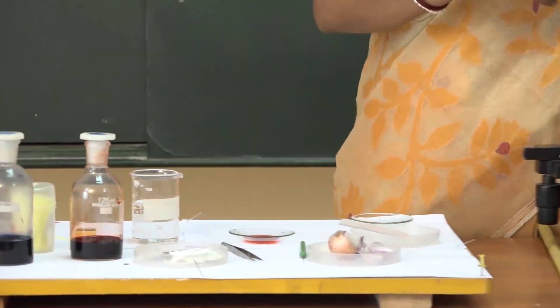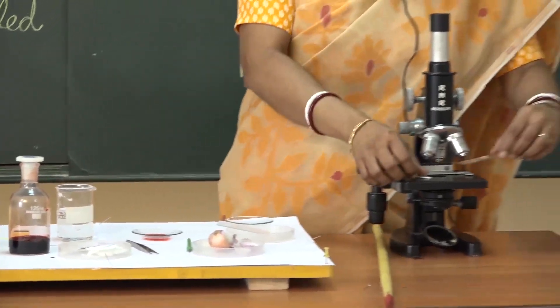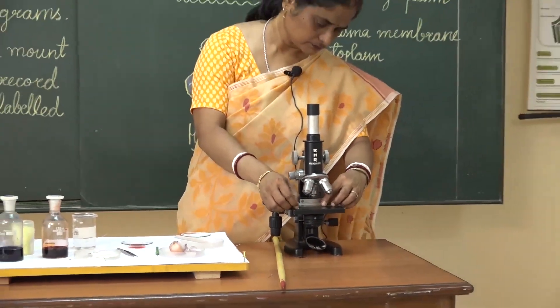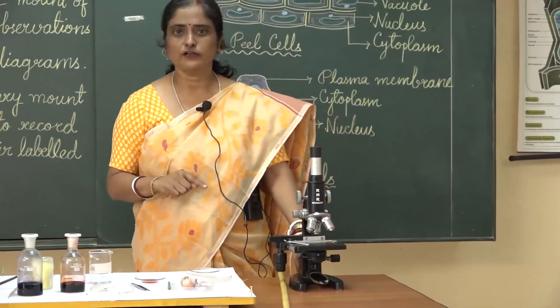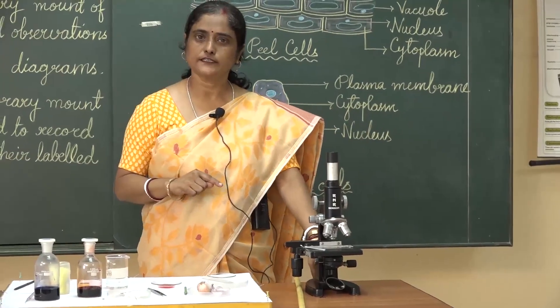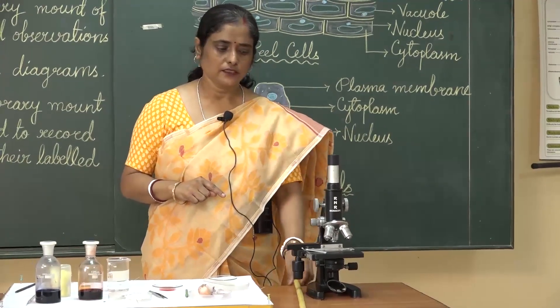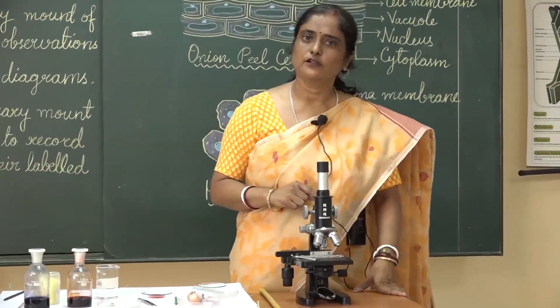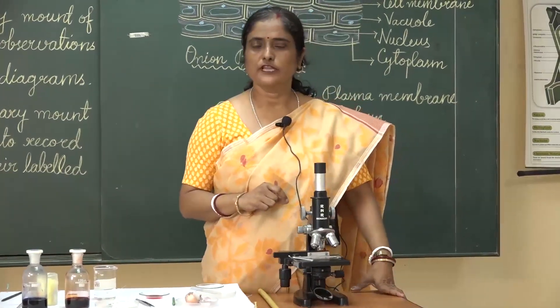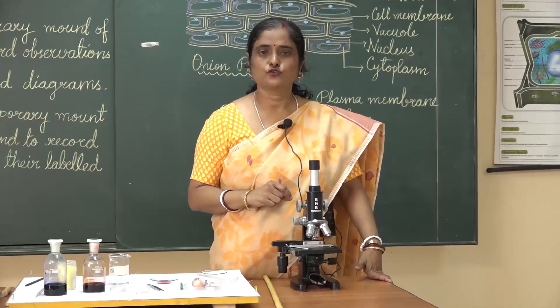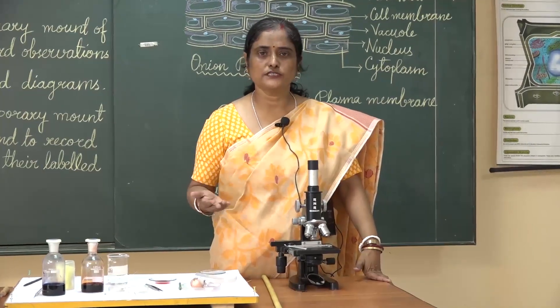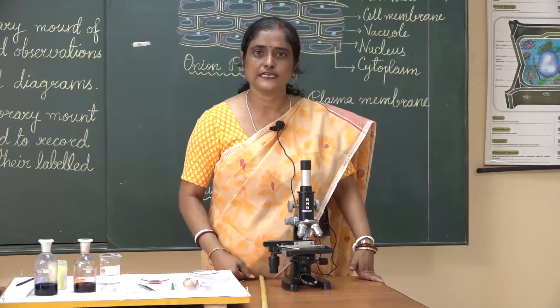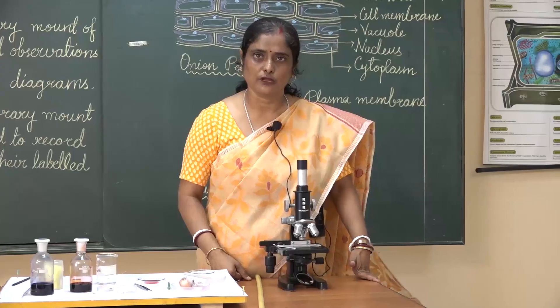Now focus it under the microscope — first under low power, that is 10x, then you can focus it under high power, that is 45x. As the resolution is increased, you can observe the cells under high power.